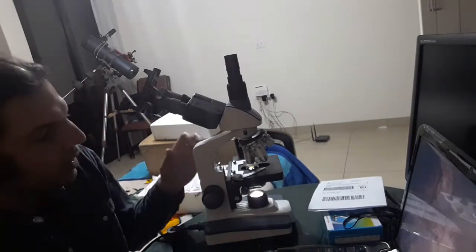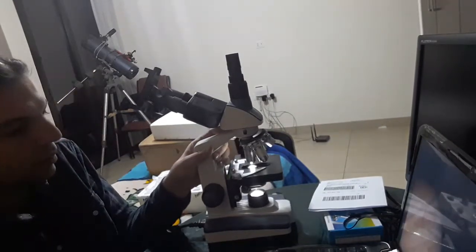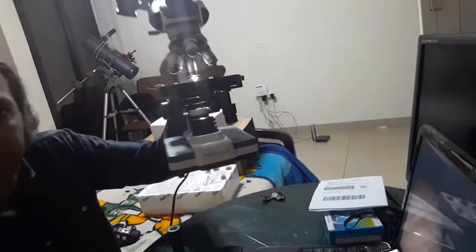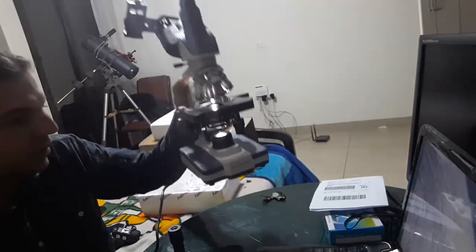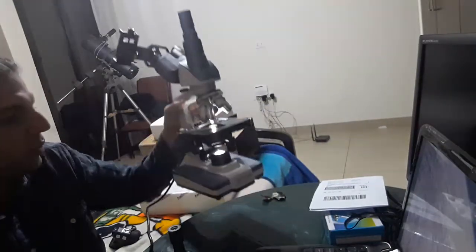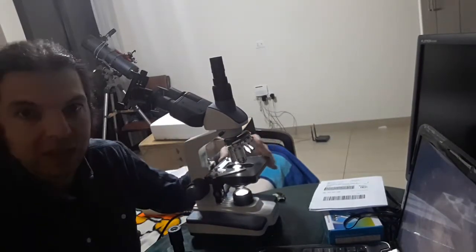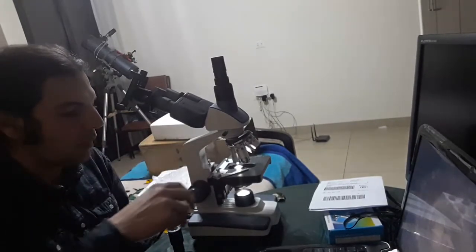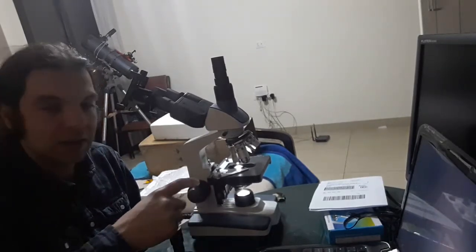This is an Amscope microscope. Underneath the stage, this is what we call a mechanical stage because it is mechanical. You can move it up and down, and this is for fine focusing the stage.